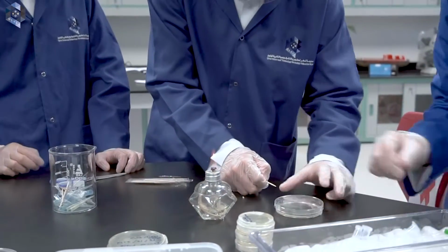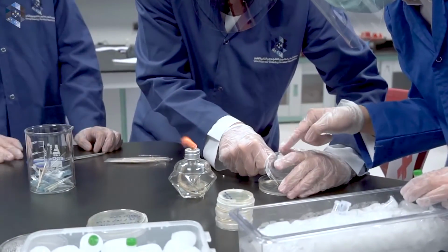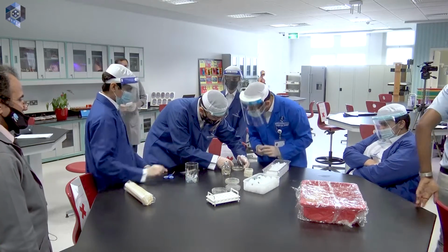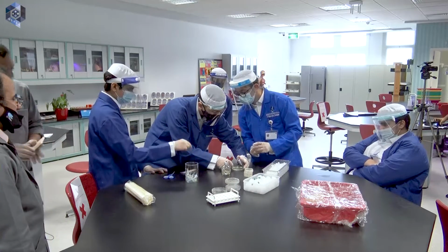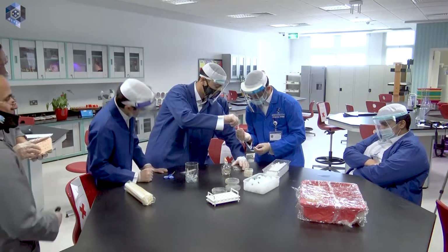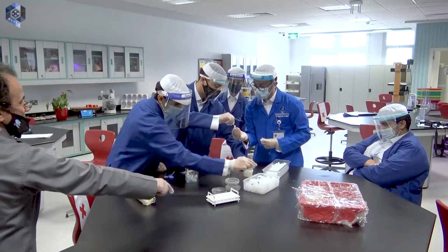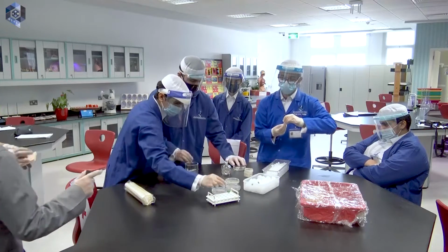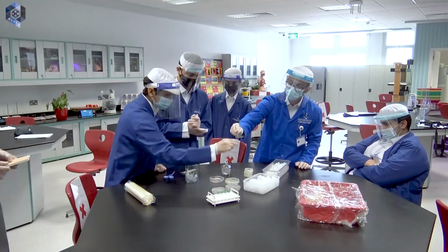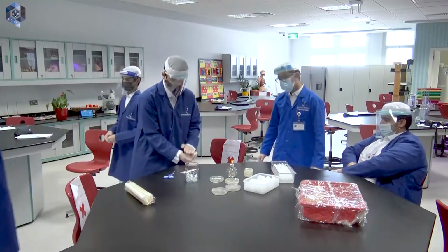Now, are you done with all the tubes? So this is the last one. Okay. Now place them in this centrifuge rack. They are in the ice now, right? We will transfer them now to the water bath at 42 Celsius for 45 seconds. Quickly move them here.